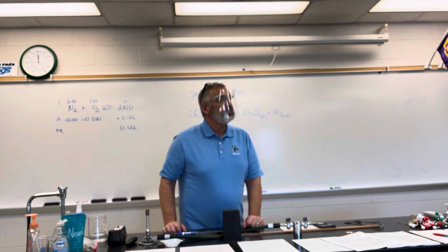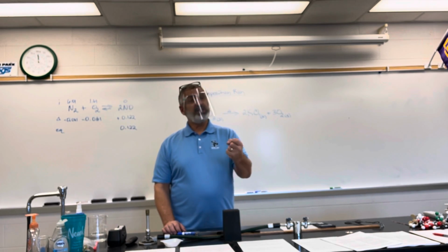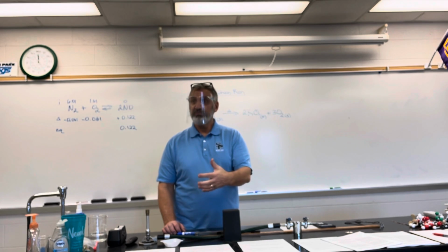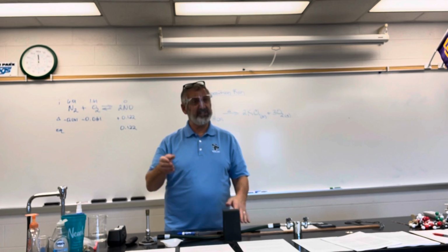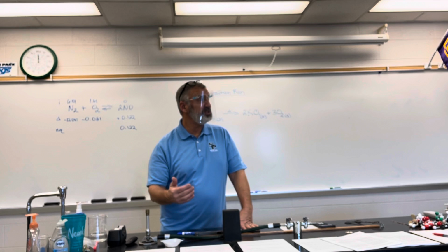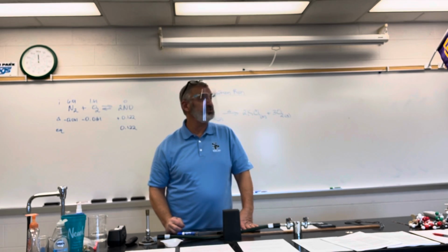All right, so we're just going to do this. We're going to heat it up 10 minutes, let it cool, weigh it, heat it up strongly again for another 2 minutes. Let it cool, weigh it. If those 2 masses are close, within like 0.01, 0.02 or so, then you're done. If it still went down a significant amount, you have to heat it again for another 2 minutes strongly until you get a constant mass. That's when we know that the oxygen is completely gone.